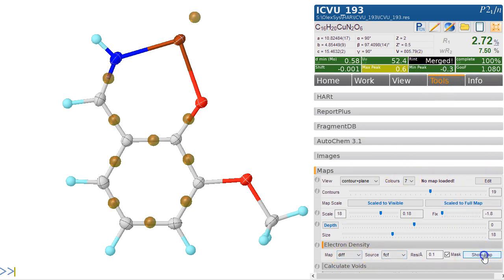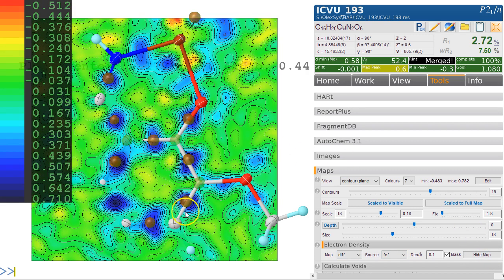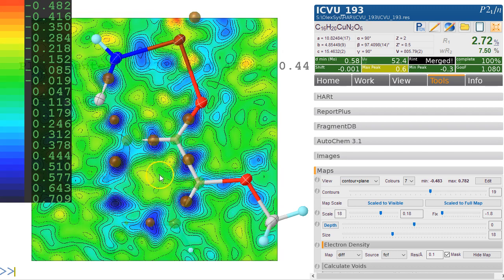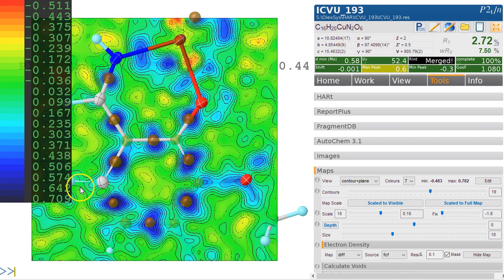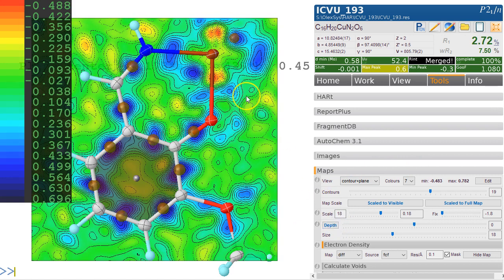What we need to do is select the atoms that we want to have in a plane—clicking on the depth button here. This aligns them in that plane. Now you can really see how the electron density has not been accounted for in those bonds.